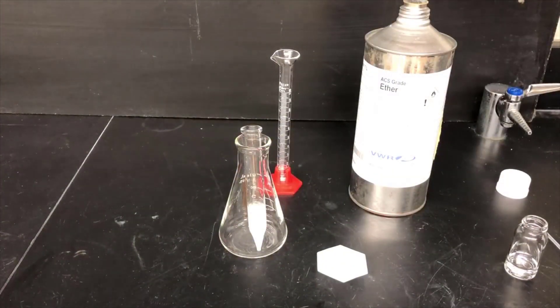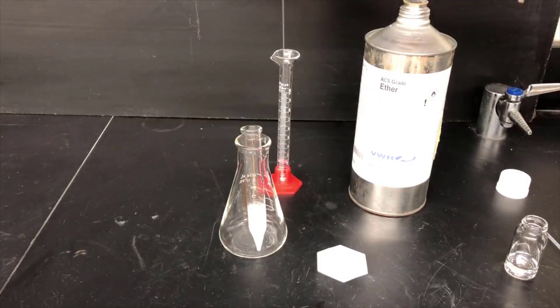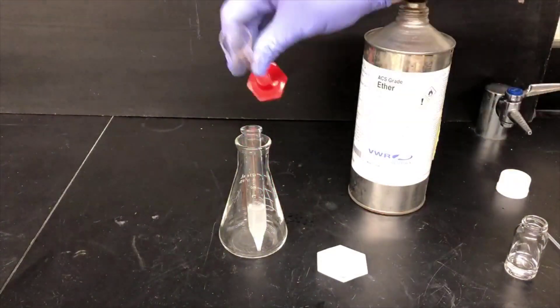Now I'm adding 4 milliliters of ether to the graduated cylinder that I used as the collection vessel in the distillation step, and now I'm adding that to the distillate in the point-bottom vessel.